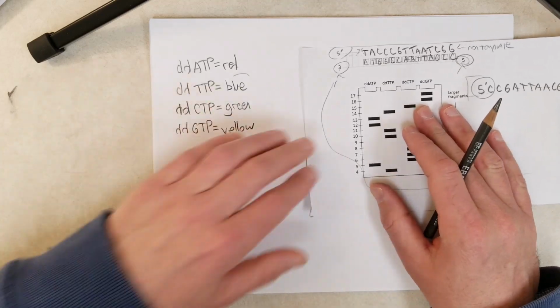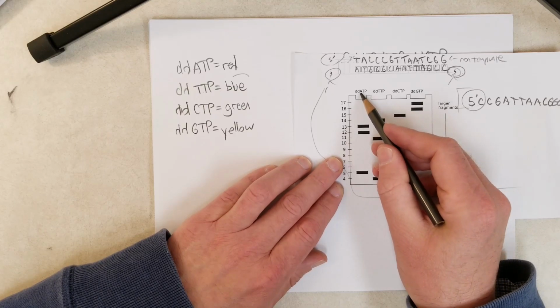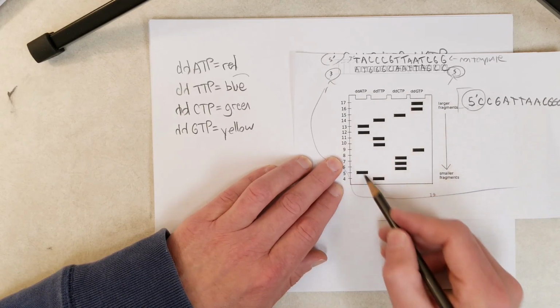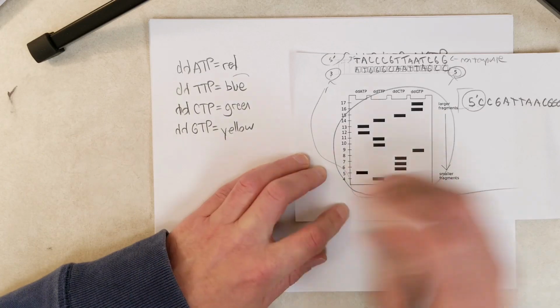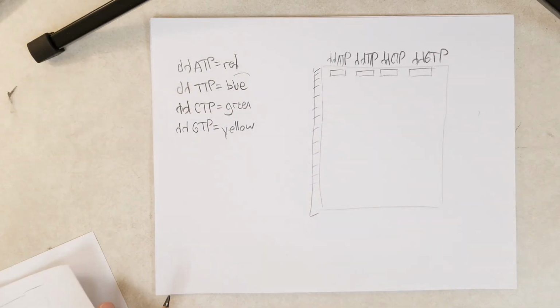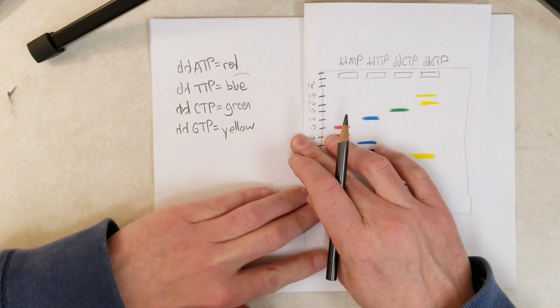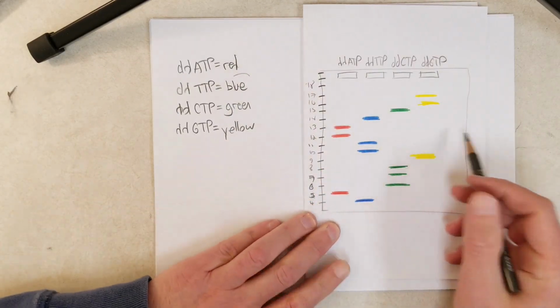So let's imagine that we use fluorescent dideoxynucleotides for this example right here. Well, what would that look like? I'm going to cheat a little bit. I already diagrammed this out. It would look something like this.